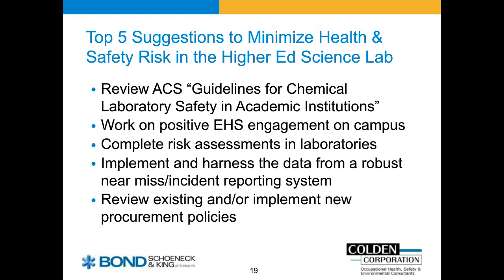I have chemical hygiene officers who routinely go to department meetings and say, hey, how you doing? Just to hear what's going on. Friendly face. Those kinds of activities. Getting your risk assessments done in the lab. Can't stress enough how important that is. Making sure you're implementing and harnessing the data from a robust near-miss system, and reviewing existing or implementing new procurement policies will get you a long way.